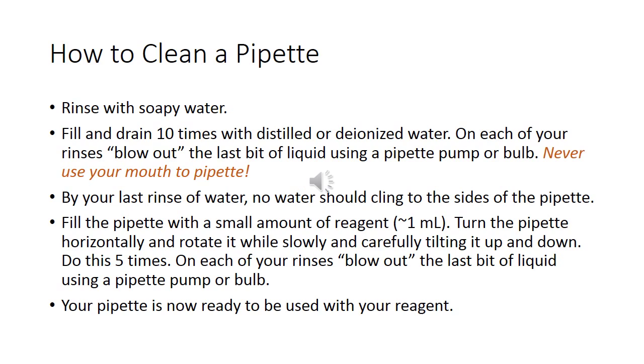So even if you were pipetting, say, somebody's blood, you're not having to take too much extra from them in order to coat and properly clean your pipette. Your pipette should now be ready to be used with your reagent. Make sure that each of your rinses have been blown out the bottom. Make sure there's no liquid left in there.